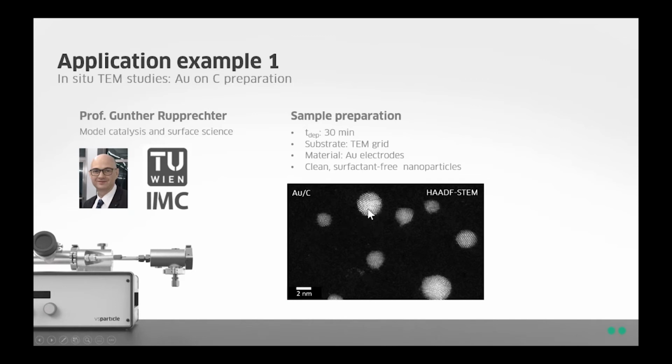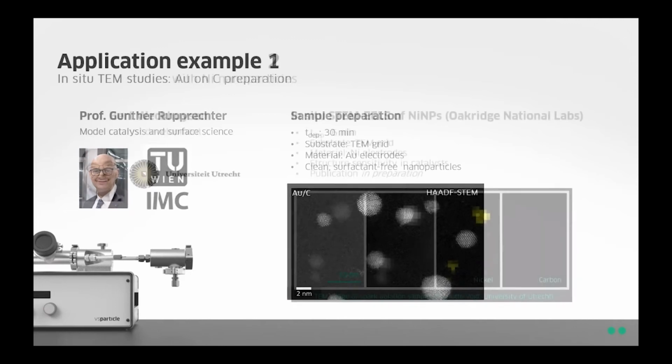And since you can see the metal lattice so well, it shows that the particles are indeed quite pure, and that's due to the fact that they are made in gas phase synthesis.